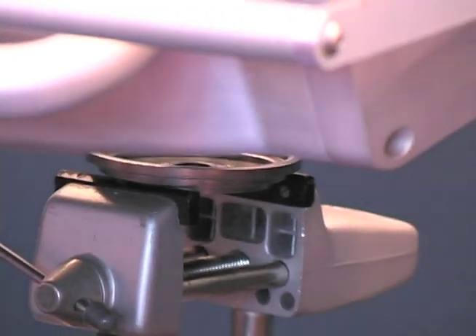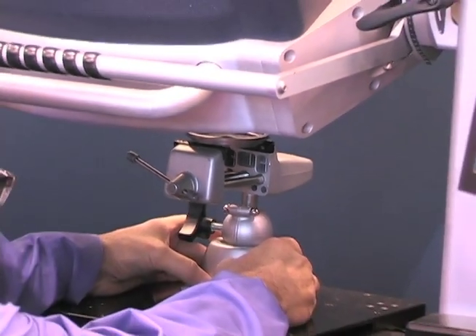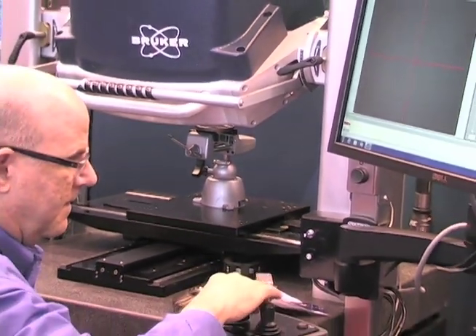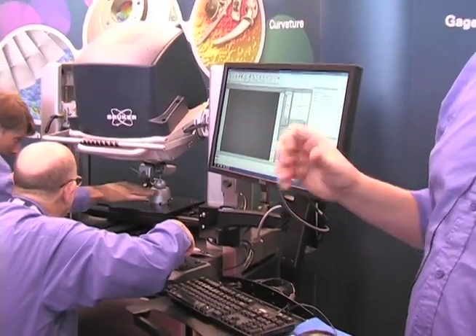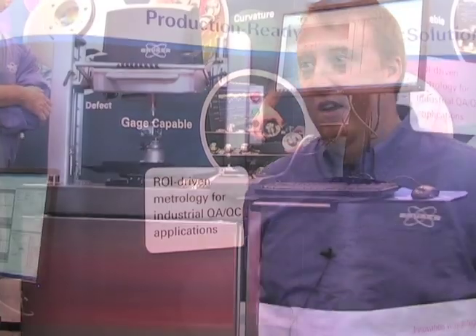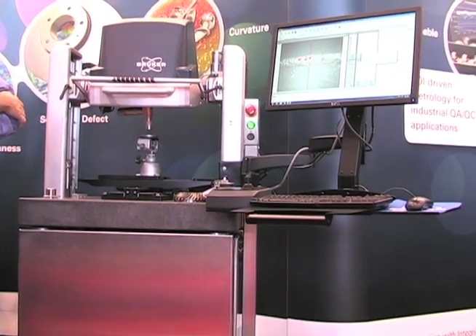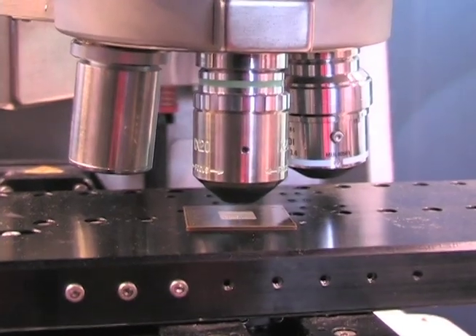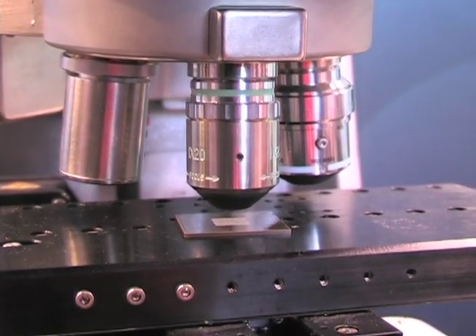This is the Bruker NP Flex. It uses essentially the same technology as our Contour GT series, except we have a flexible head that allows us to pivot at multiple different angles, with a 12 by 12 by 12 full field of view for large parts at complicated angles and geometries. This machine was designed to let us explore bigger parts with the same vertical scanning resolution as our flagship Contour series.